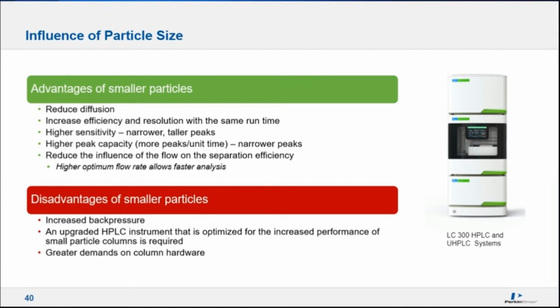However, there are some disadvantages. We do have increased operating back pressure. The HPLC instrument must be matched to the smaller particles, and it also puts a greater demand on the column hardware to utilize the performance gains from the smaller particle sizes.